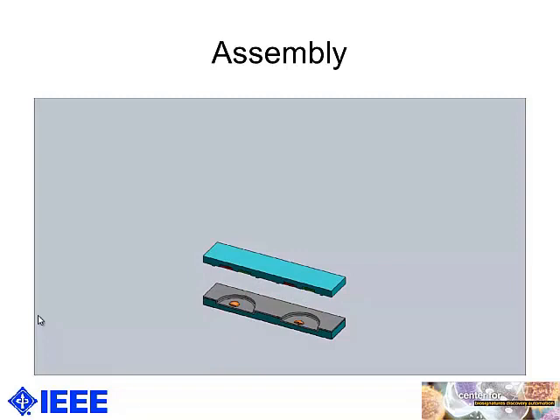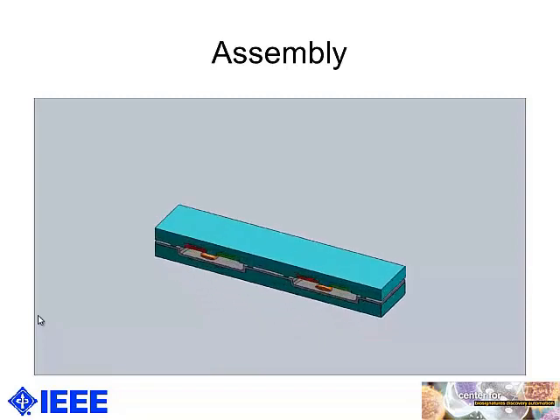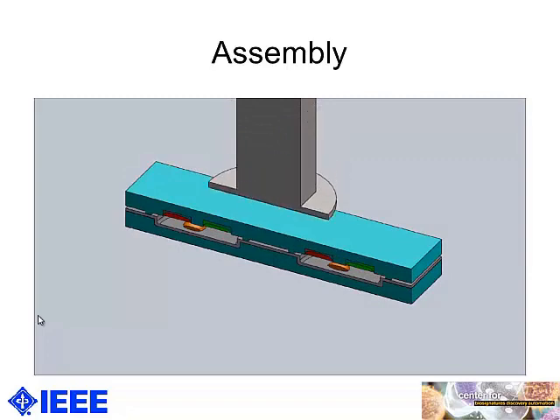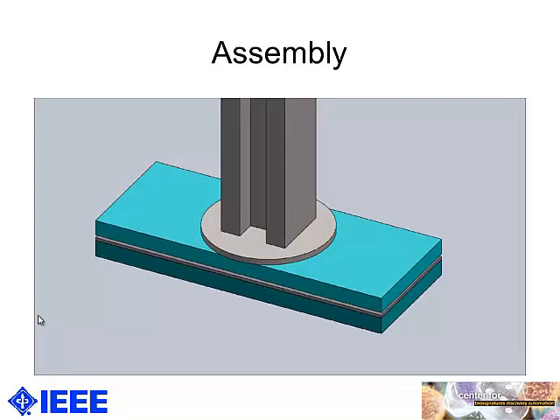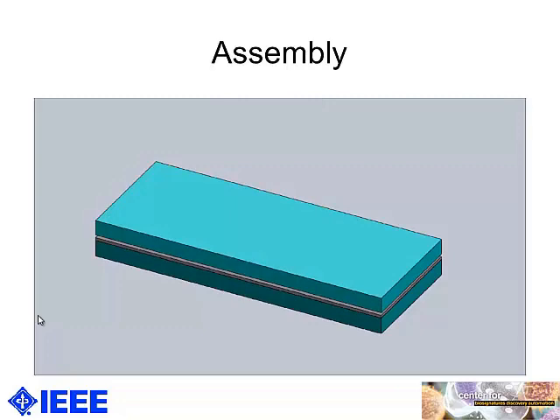And if we place the top lid on the bottom wells, we'll see the cells and the sensors placed in an enclosed space. And then we use the piston to press the top lid to make a sealed environment. And we'll use this device for the following test.